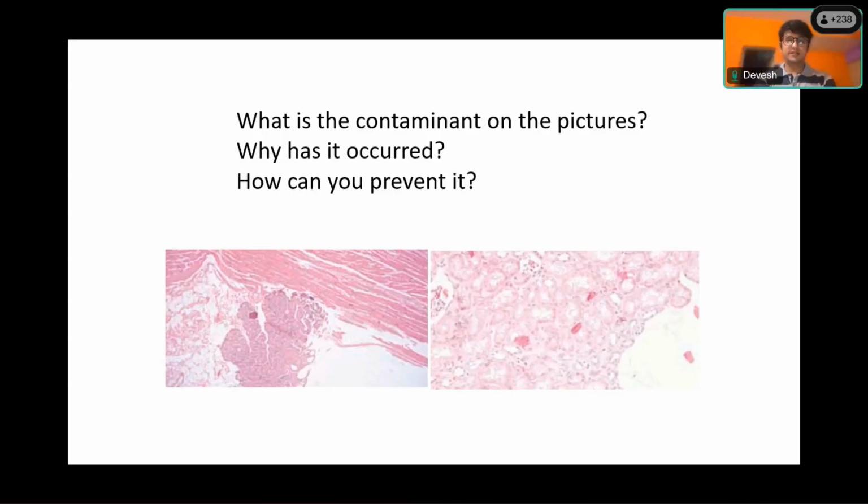In our institution, they wrap a piece of tissue paper around a holder or a brush and skim the surface. Correct, exactly. You just skim the surface of the water bath with tissue paper so that all these small floaters, the tiny ones, are removed. To make it less expensive, we actually just use newspaper. We just clean the surface of the water bath. Very, very important, because once it enters the tissue, you can make a wrong diagnosis.